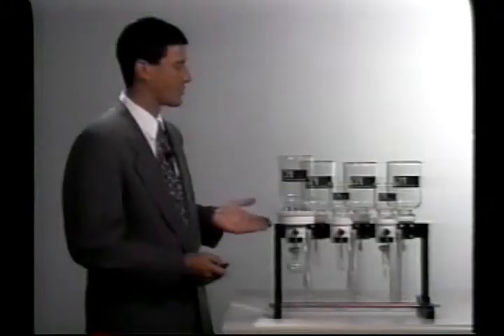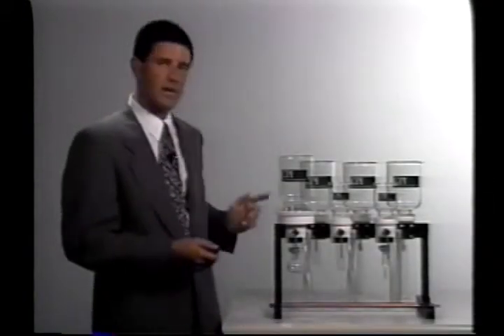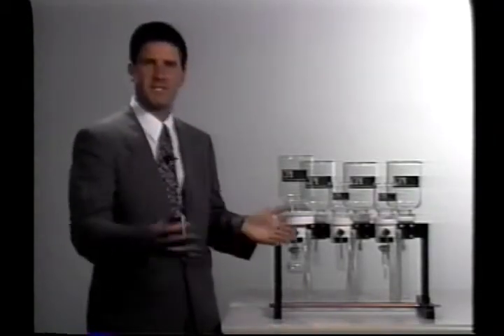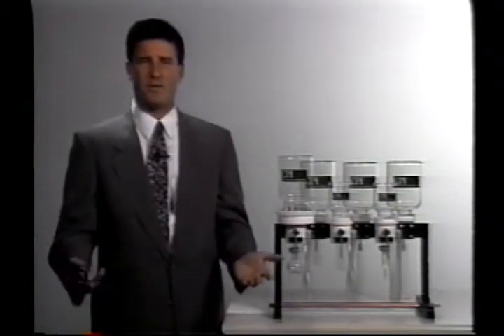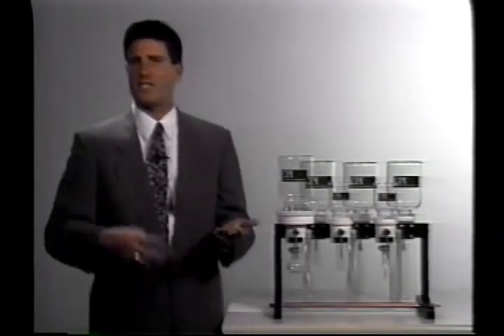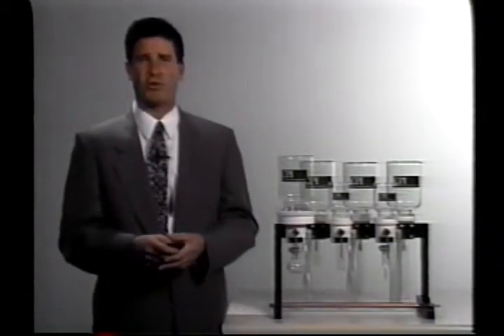This manifold here is currently set up with six stations. However, you can order just a rack in one position and then build up to six as needed. If you need more than six, you can start off with two manifolds, even three manifolds, link them together and have six, twelve, or eighteen positions. Again, we wanted you to have a lot of options as far as getting the setup which is most appropriate for you.